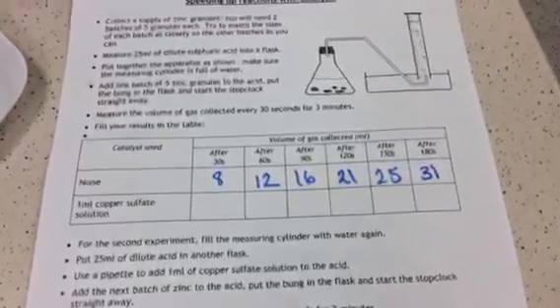Okay, so we'll stop this experiment and then we'll have a look at the reaction with catalyst, and we'll see if it's altered the rate of reaction at all.